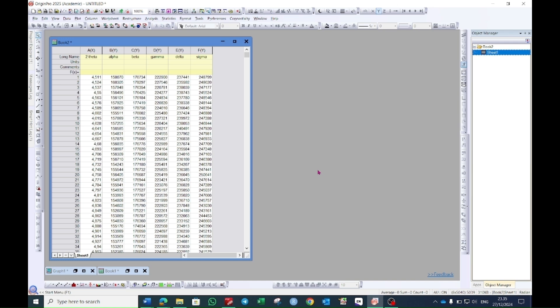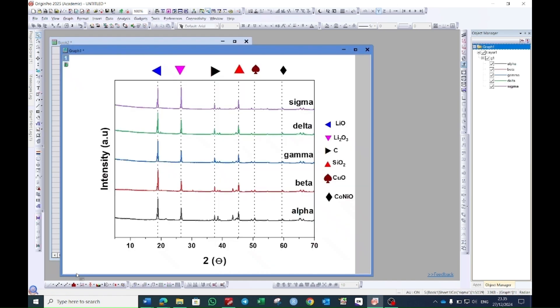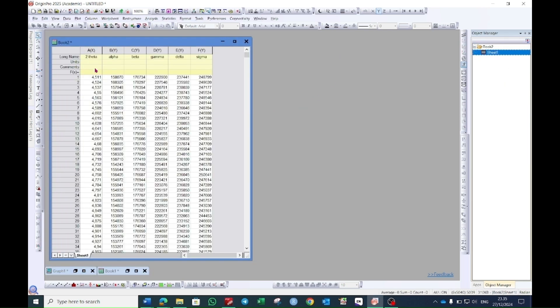Hello everyone, today I will show you how to create an XRD graph in Origin. The graph will look like this at the end of the video. Here I have two-theta values in the X column, whereas five different samples are in the five different Y columns.